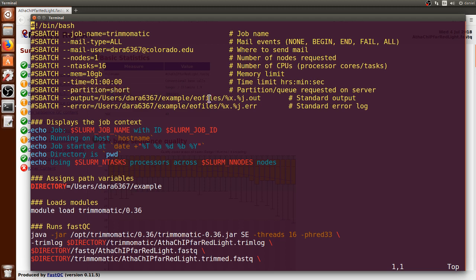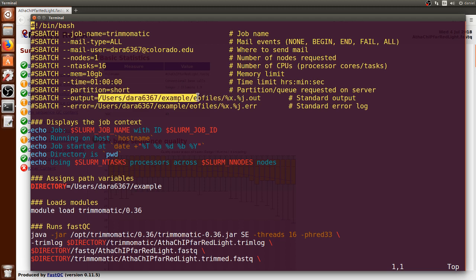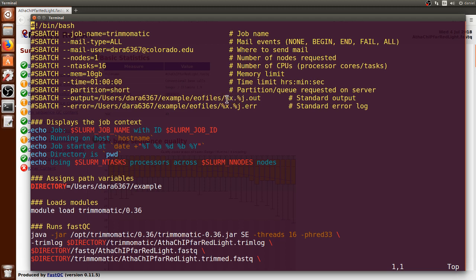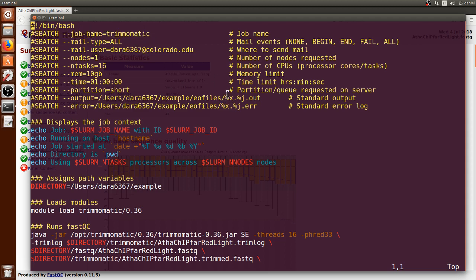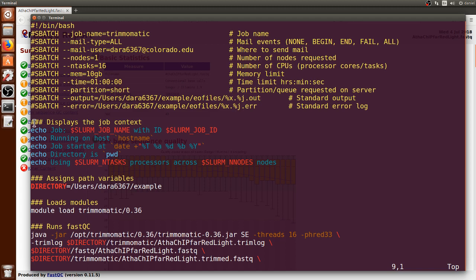The output and error files will go to the EO files directory and will have the job name, the variable percentage X, followed by dot and the job ID for both the output and error files.